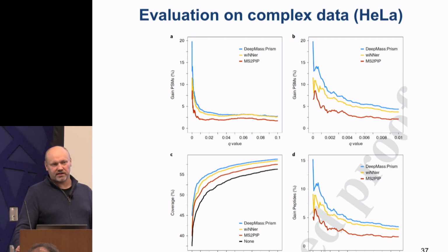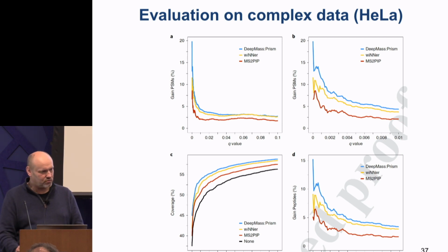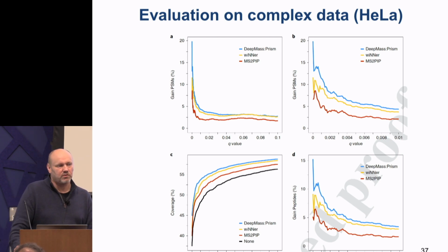If you just get that standardly with every HeLa run you do, that's nothing you would want to miss, basically, right? And my expectation is that if you go into more difficult situations, and that's also something that the people from north of Munich are showing in their paper, like proteogenomics or something like this, the gain factor is much bigger, right? So if it's more challenging, it's helping more.